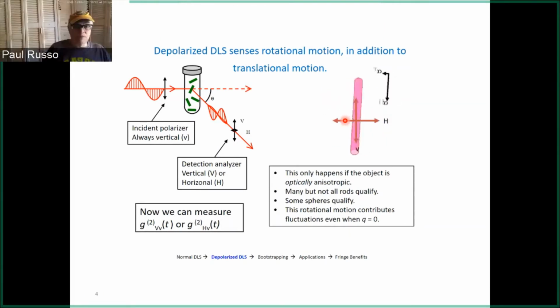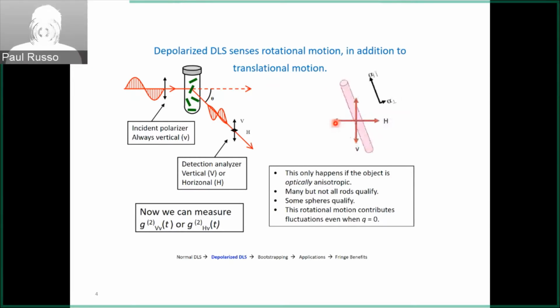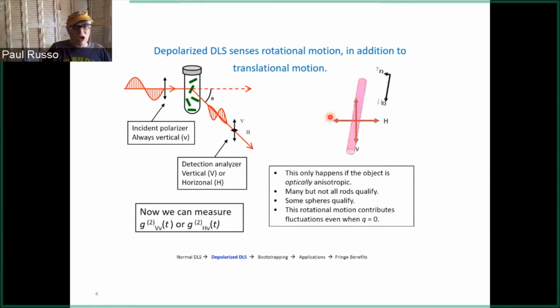It's kind of hard to do. Imagine the rod is vertical: the electrons in it get excited up and down, but they don't depolarize any light unless the light is also polarized up and down. If the rod is totally horizontal, not much scattering occurs, because the electrons usually want to move up and down the length of the rod, which is easier for them. So it's when the rod is at crossed angles, 45 degrees, that you get some light. That's what this is supposed to show, but I think it's kind of out of phase. If you're used to looking at Maltese patterns and spherulites, it's basically the same argument: you get the light at 45 degrees.